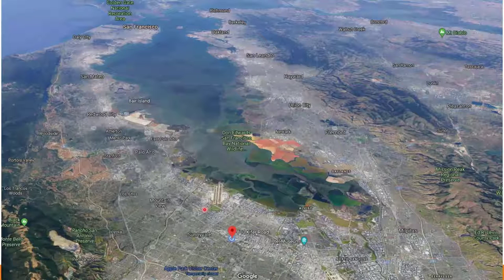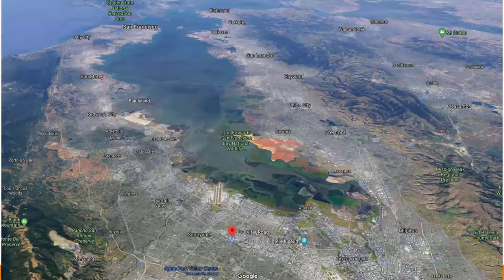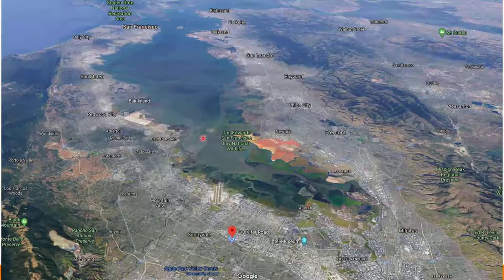So first, as Liam just mentioned, I have been in the Bay Area for a very long time. So our lab is somewhere here. Just for reference, this is San Francisco airport, a very nice picture of the Bay Area. Of course, we serve a lot of the companies in the Bay Area. We work on semiconductor as a major part of our business, but we also analyze a whole lot of other materials. I found that the EELS technique is very, very useful for material analysis.